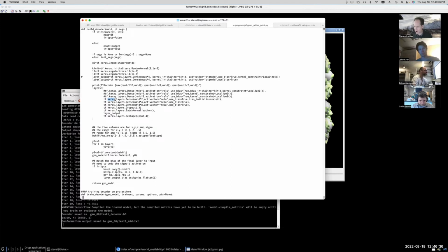If you want to define an arbitrary network with some really advanced sorts of features, you can't easily do it with Keras. But if the network structure you're putting together is a fairly straightforward set of fully connected or convolutional or partially connected layers, sort of standard types of layers in deep learning, which are part of Keras, then you can basically just say, okay, I have a layer and it's this big.